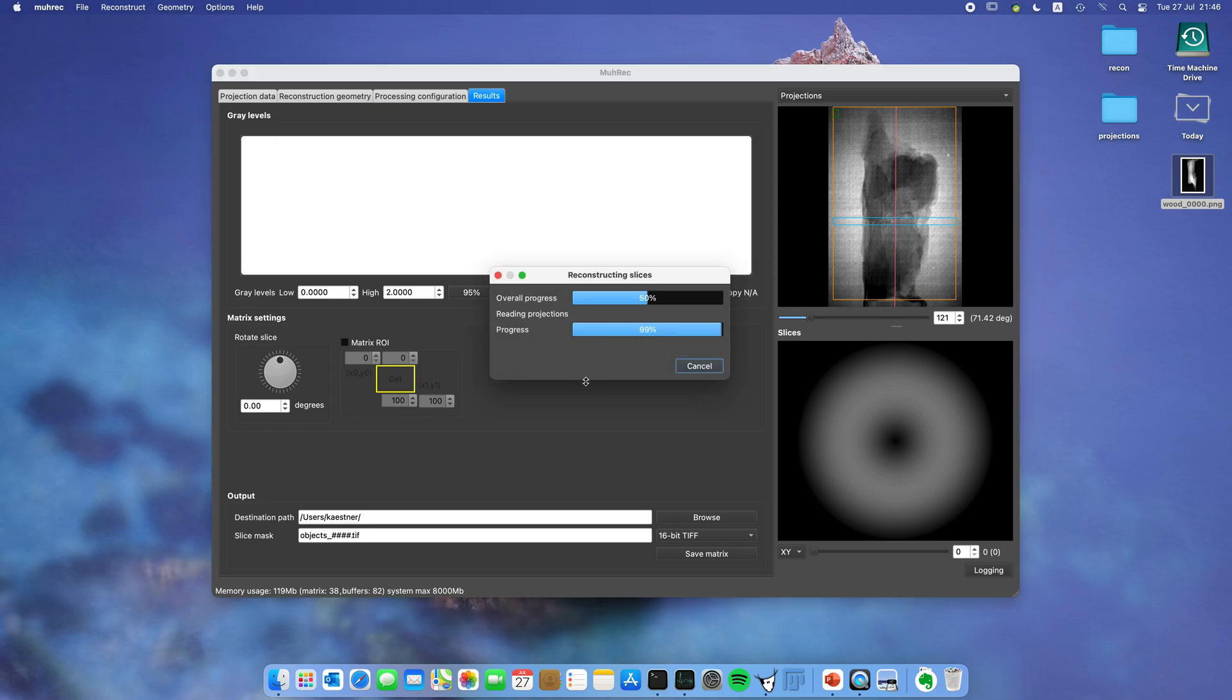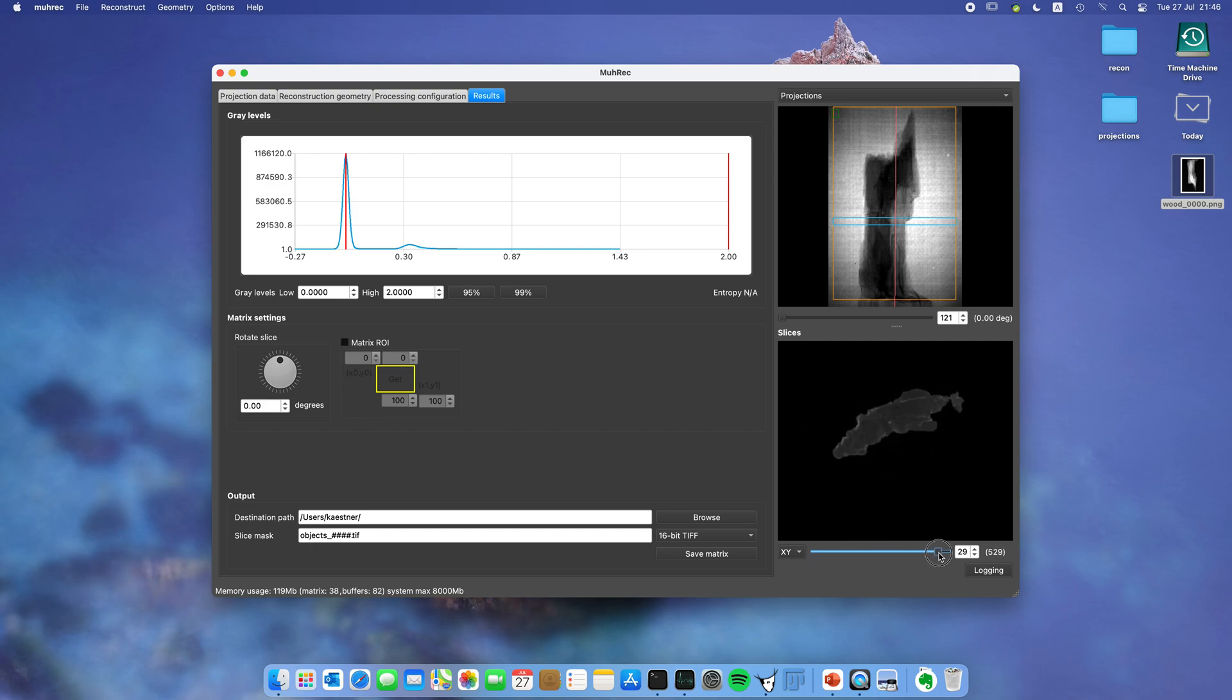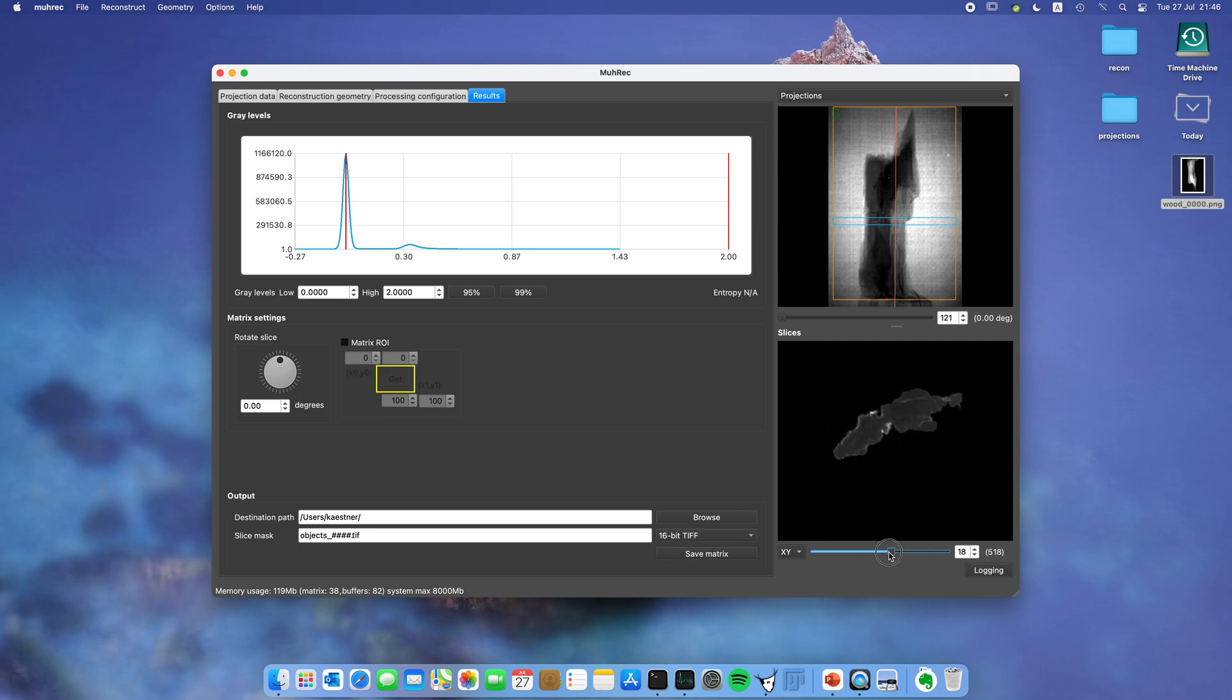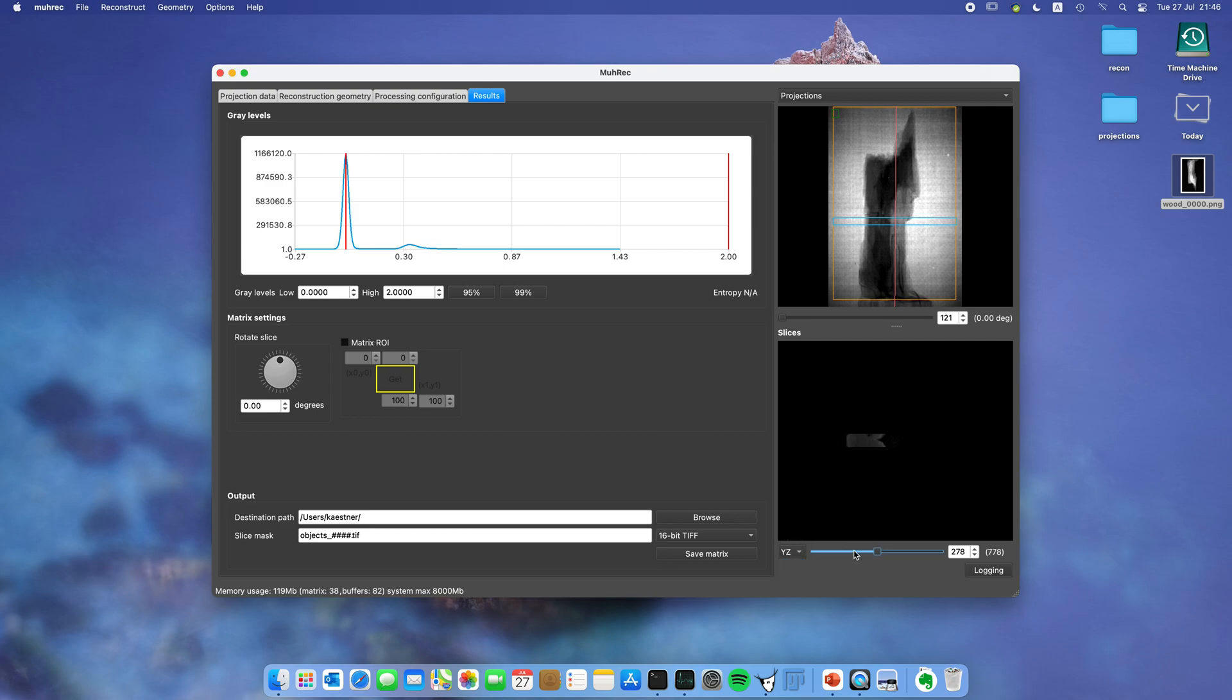Now to start the reconstruction you move to the reconstruct menu and start reconstruction. You can see that something is going on. Now we have reconstructed 32 slices of this sample. You can see here if you drag the slider you can look at different slices. You can also select which image plane you want to look at. You can see the vertical planes. Let's go back.